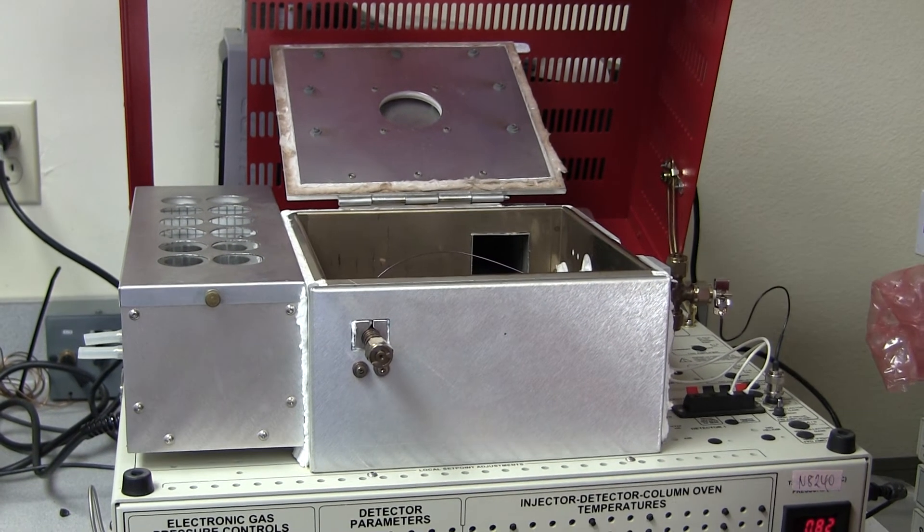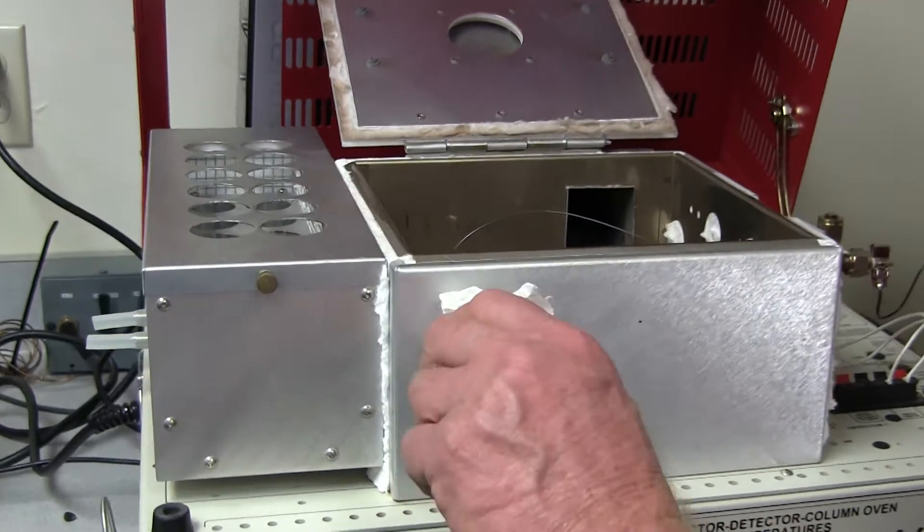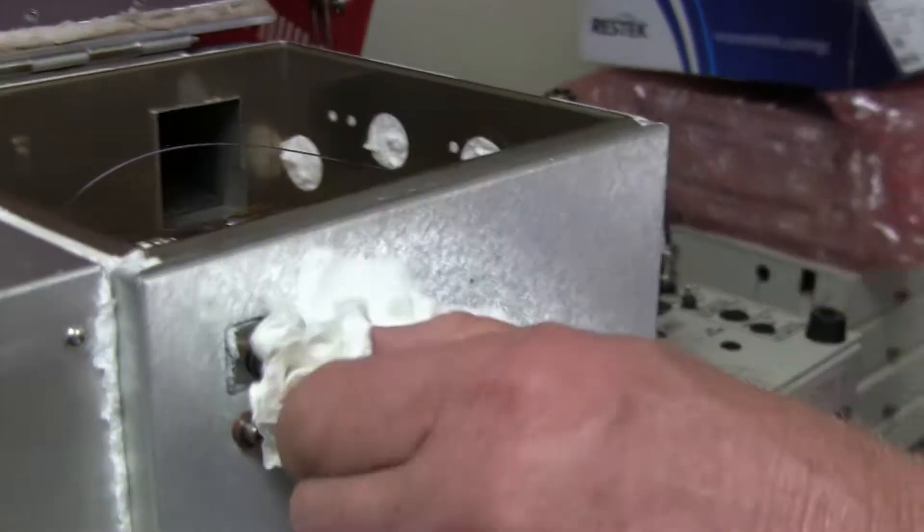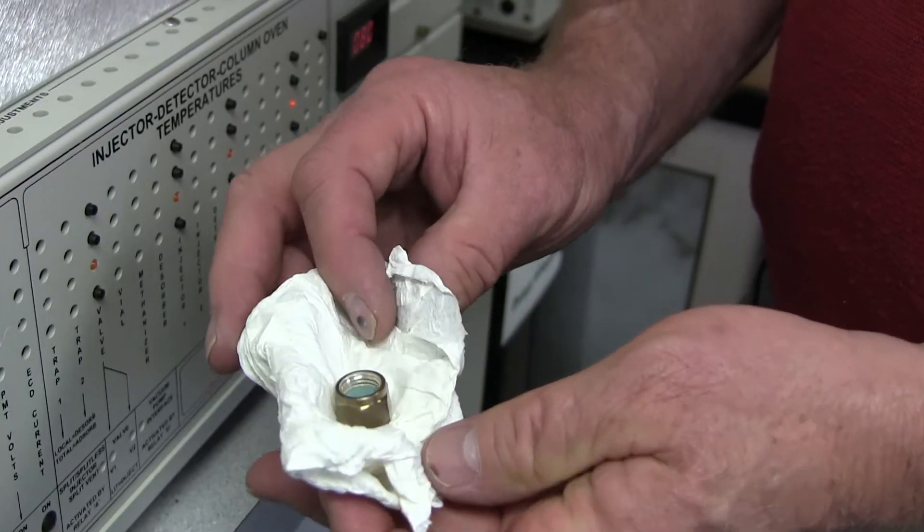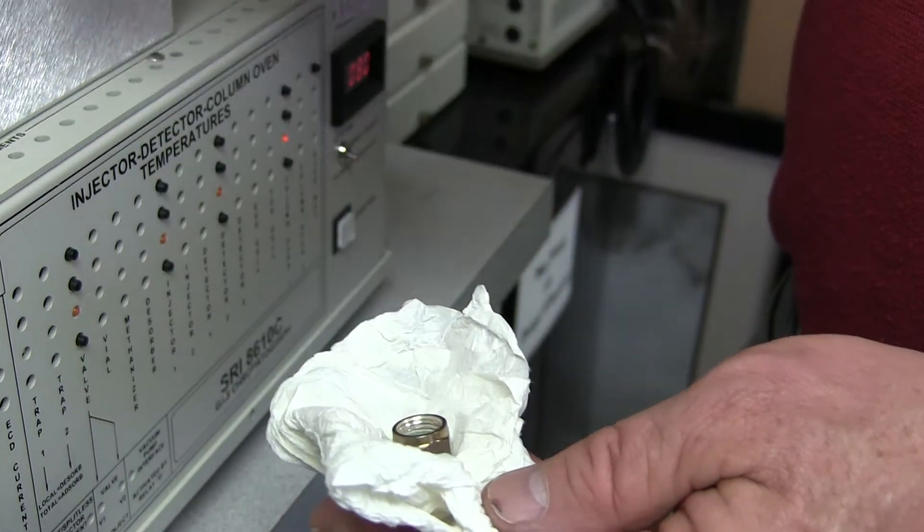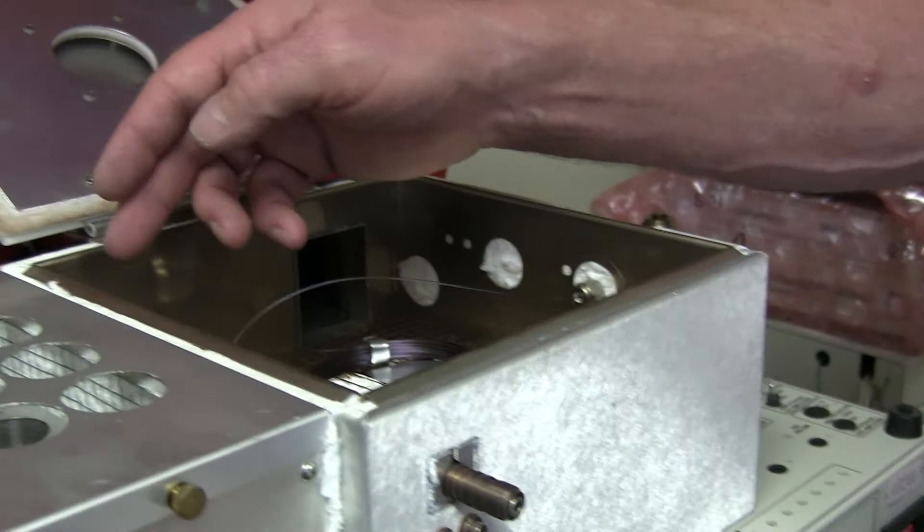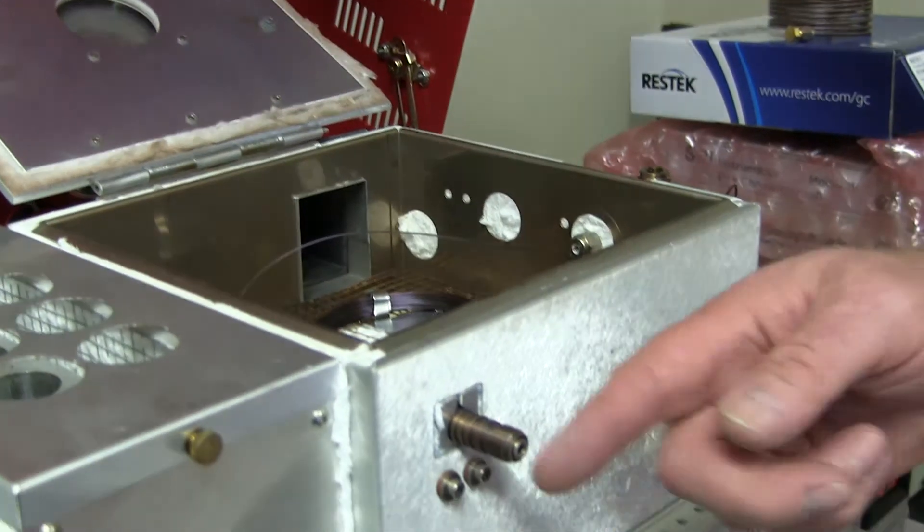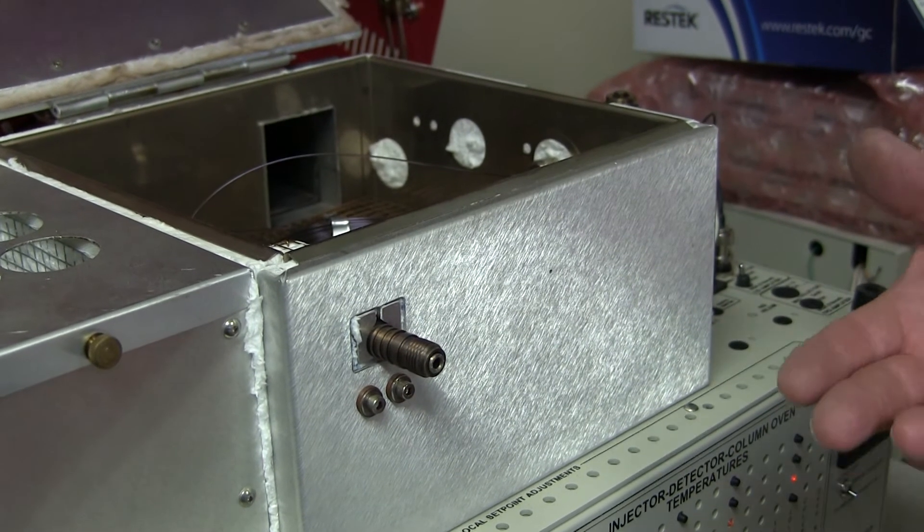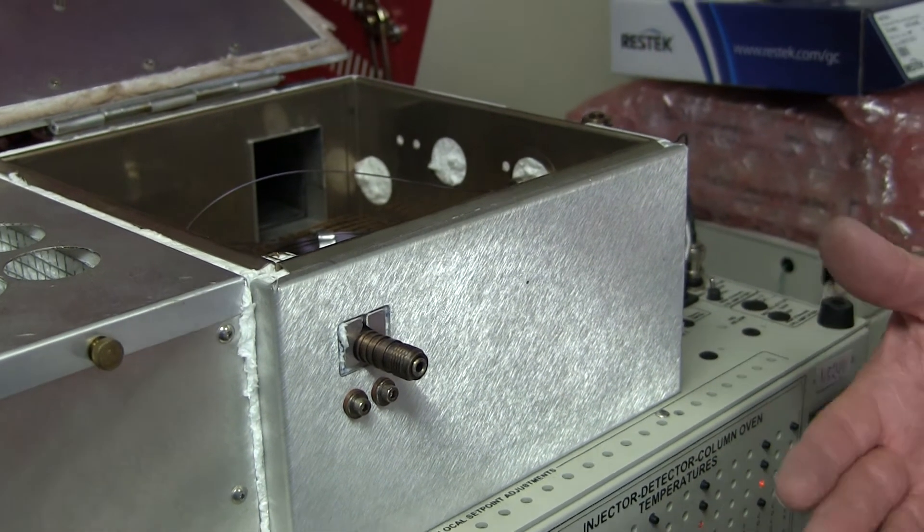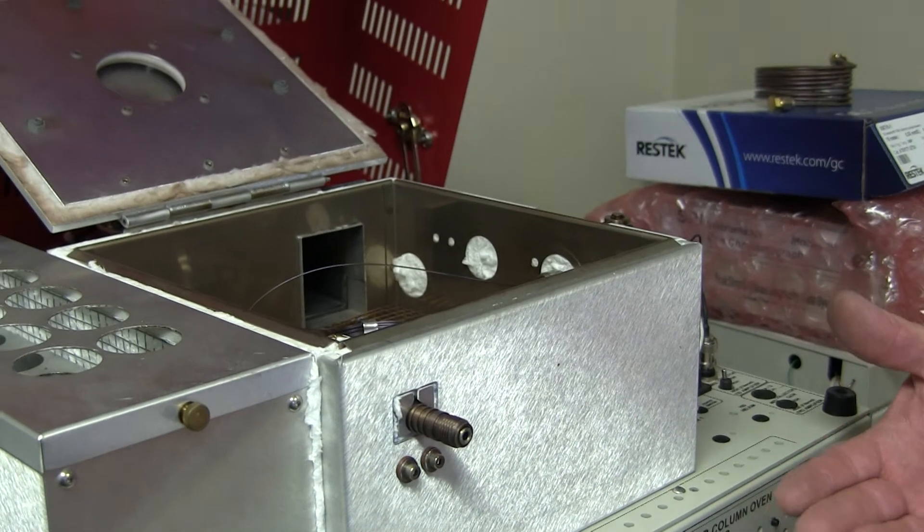So if that's going to be a problem, what we suggest you do is, while you're baking the polishing filter out, remove the septum nut from the GC. This is hot, that's why I'm handling it with a cloth. Now, the contamination from the polishing filter, instead of going onto the column, all exits out the front of the GC and none of it gets onto the column. You would choose to do that when you had something like a molecular sieve column in the GC.